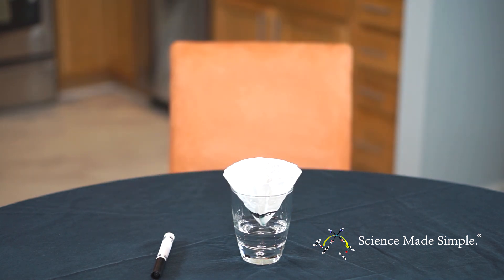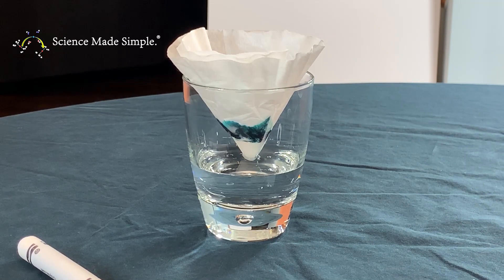Now, we wait for a few minutes as the water slowly moves up the filter. Make sure to write down your observations as the process continues.